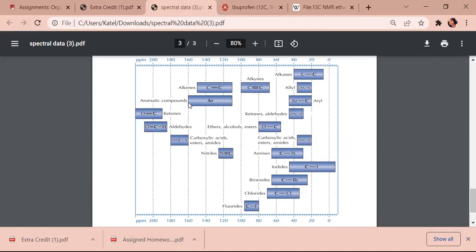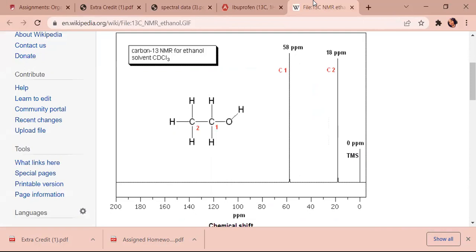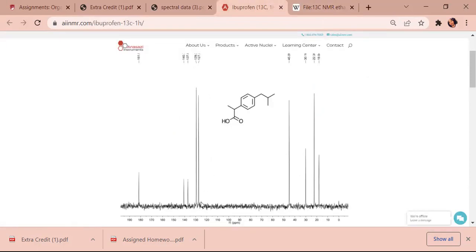I feel like you would know if it was an alkene, because there wouldn't be this oddness in like too big, too little. Like if it was just a normal straight chain alkene, it would just be like that.